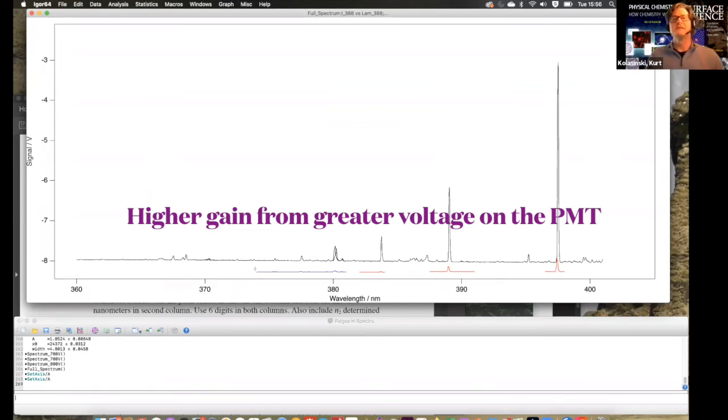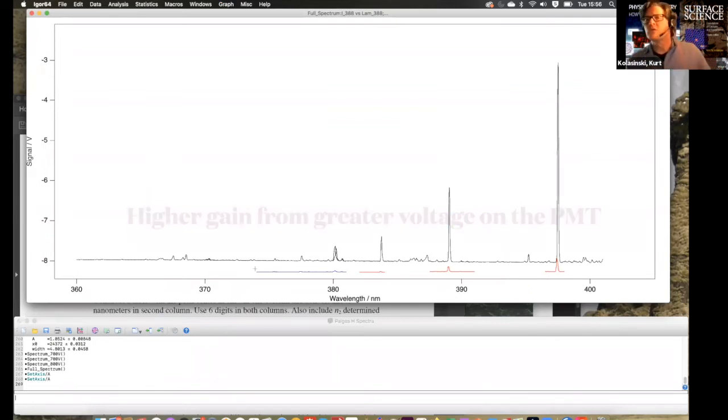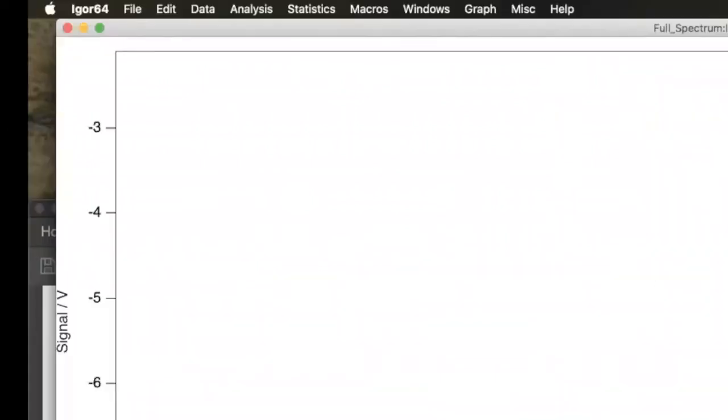And then these ones, that's going to require some interpretation. One thing we've got to see: do they fit the trend, right? Okay, so now what else do we want to do? What we want to do is figure out where the peaks are, right, in wave numbers. In inverse centimeters, we're going to measure those rather than in nanometers. So we need to convert the wavelength into wave number. How can we do that?